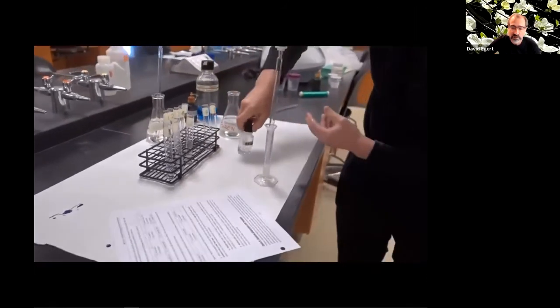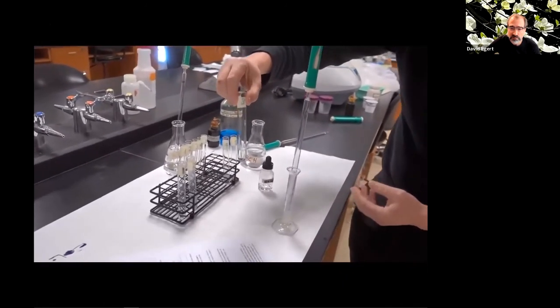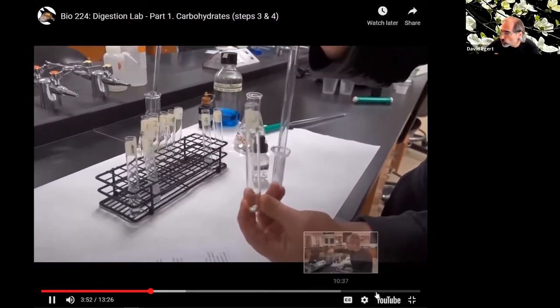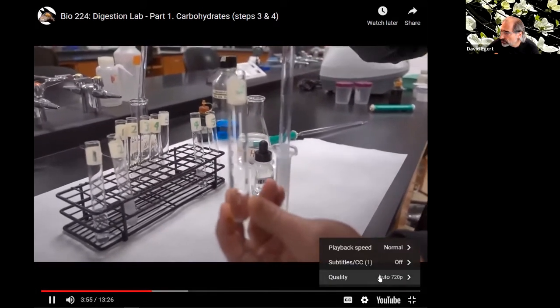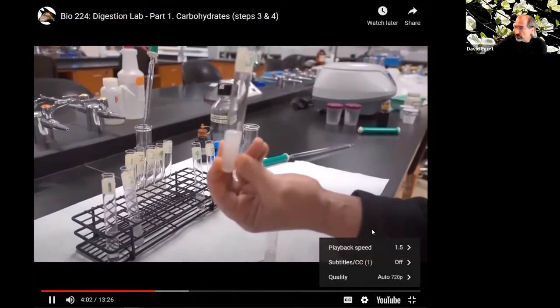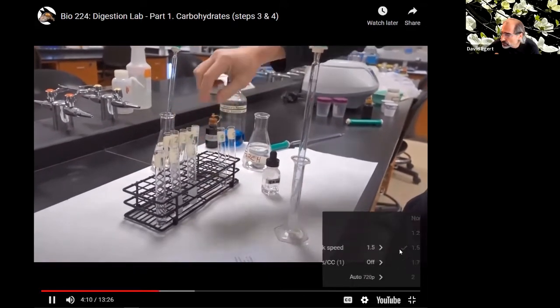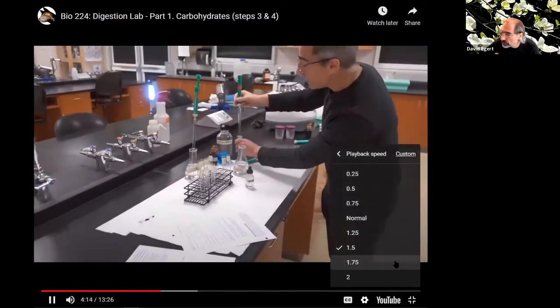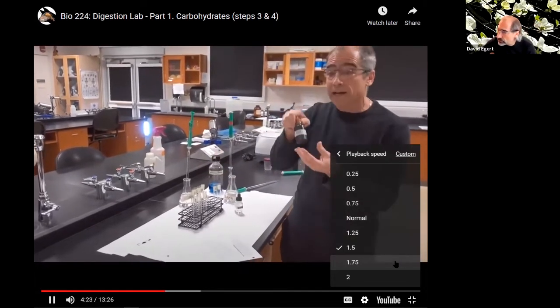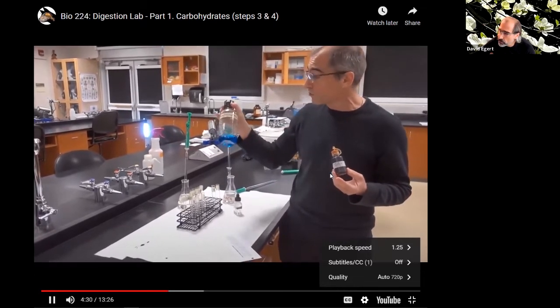Now we have this very low pH solution, and now we're going to add 3 mL of our saliva into this. So 3 mL of saliva, but the conditions here are going to be very acidic for this salivary amylase to try to do its job. It's important to remember that each of these tubes we're going to be testing both for starch using iodine, as well as testing for the presence of the products of digestion, maltose, which we're going to use Benedict's reagent for.